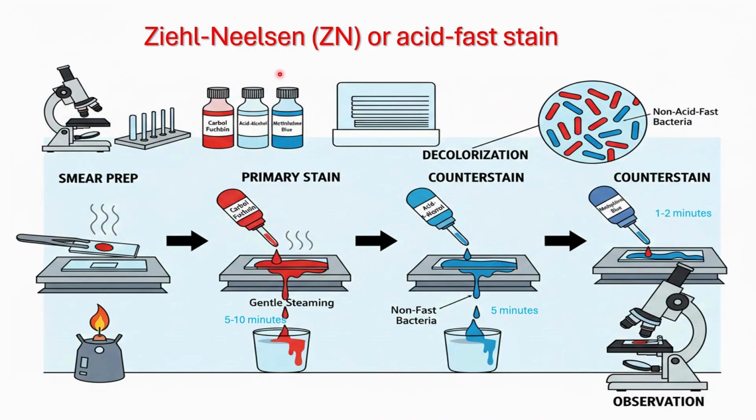Procedure of acid-fast staining. Begin by preparing a bacterial smear on a clean, grease-free slide using sterile technique. Allow the smear to air dry completely and then heat fix it. If the smear was not prepared from bleach-treated sputum and will not be stained immediately, perform alcohol fixation. Heat fixation alone does not kill the Mycobacterium tuberculosis in untreated sputum, whereas alcohol fixation is bactericidal.